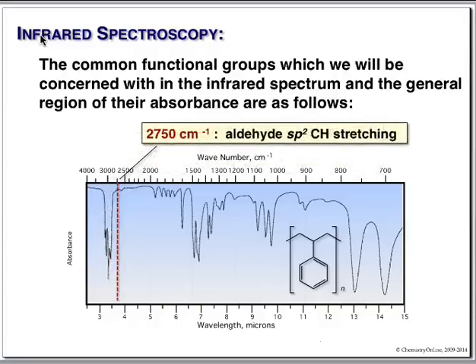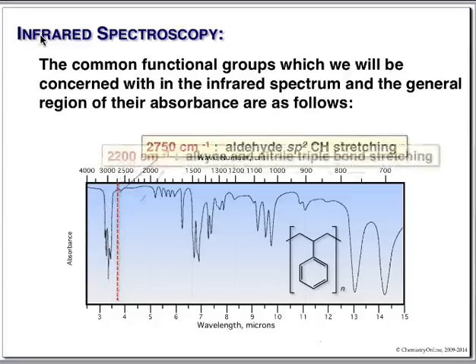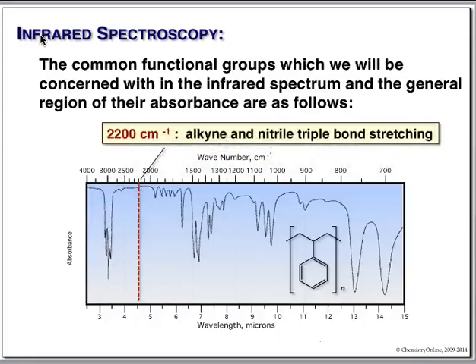Aldehydes have a very low CH stretch. This occurs at about 2750, usually two peaks. We'll look at these, but polystyrene, of course, does not have an aldehyde. We have no peaks here. Our triple bonds are going to come in this region. No triple bonds in polystyrene.